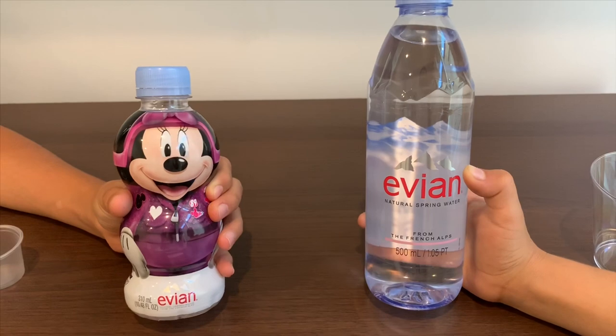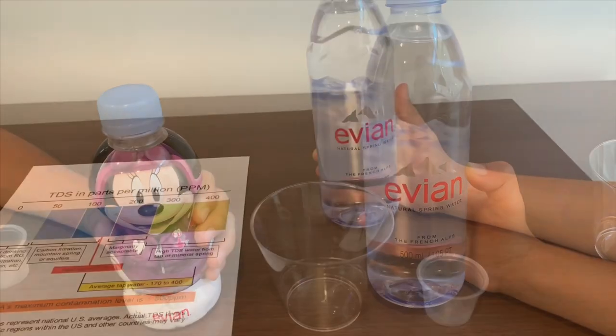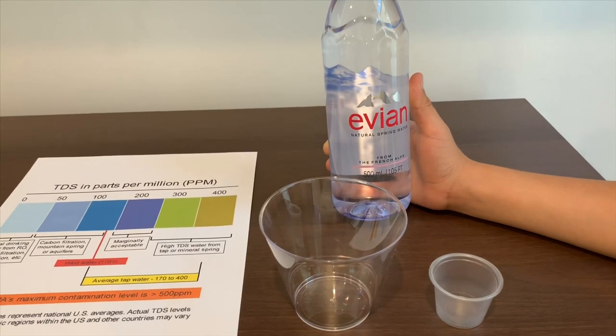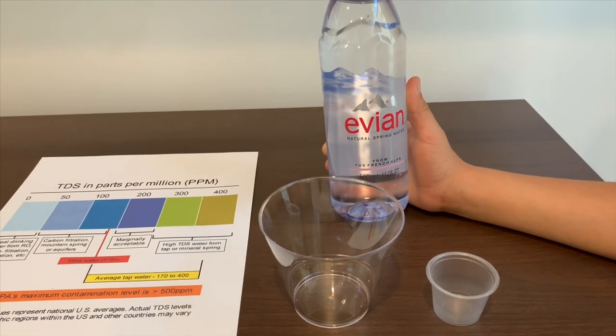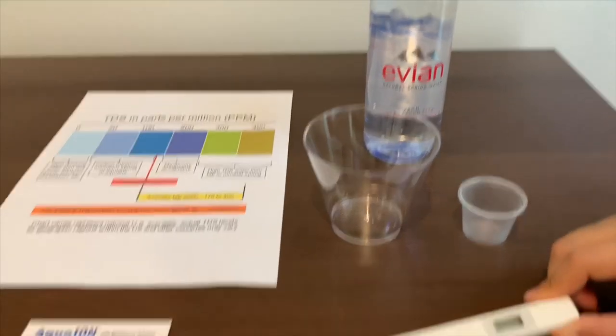We're going to test Avion Kids and Avion Regular. This is Avion Natural Spring Water from the French Alps. Today we're going to test the TDS levels and the pH.